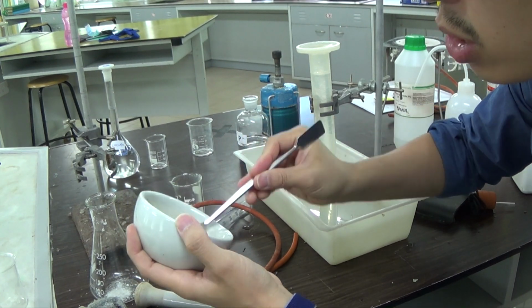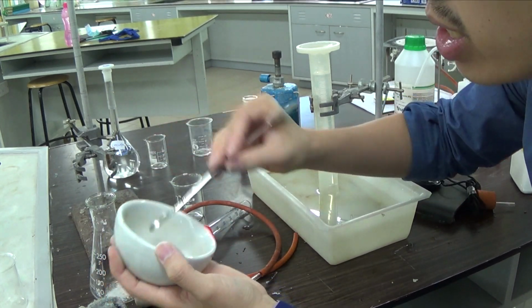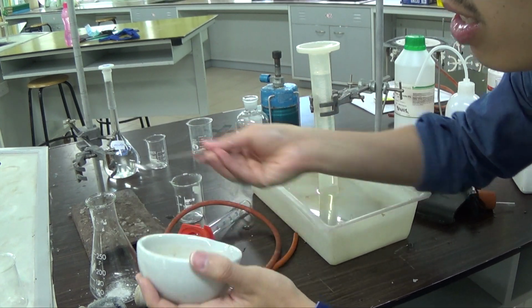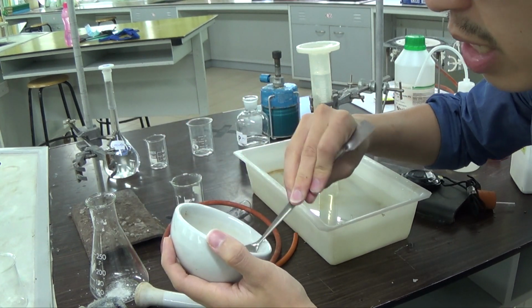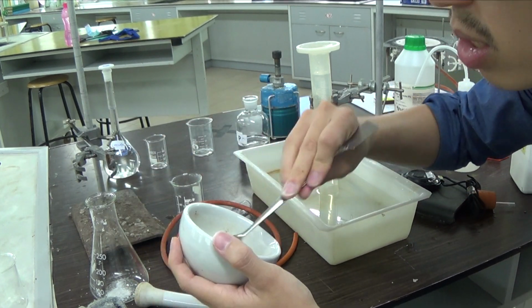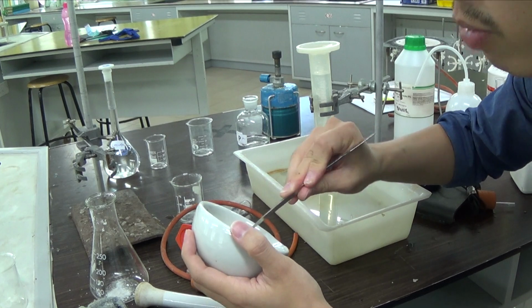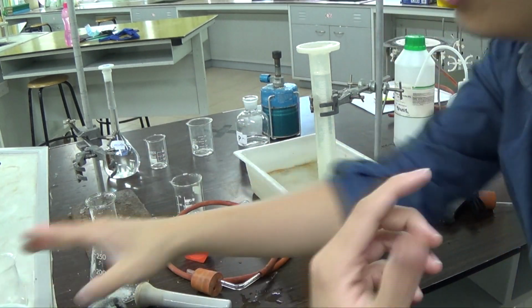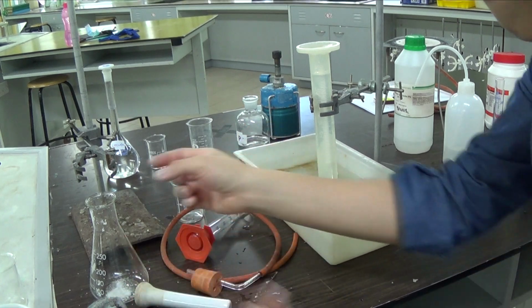surface area of the solid, so surface area is what we are changing, and we are not changing any other factor. In this experiment, the things that you don't change at all, you keep them the same in the 2 experiments. They are what you call control variables. Control variables means you don't change these factors, but they could affect your reaction.